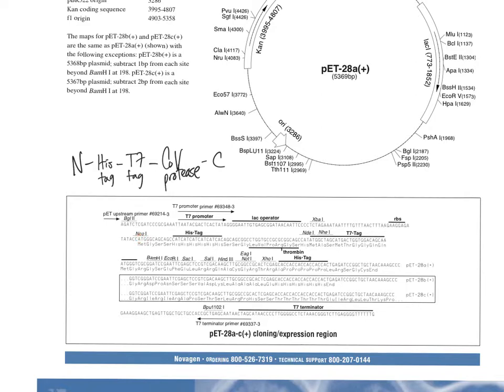And so if we let this stay, in other words, don't mess with this part, this is just going to be like what we had with our ADC7, the mutant, in that it starts here. So here's residue 1 right there. There's residue 1 that's going to end up being translated.